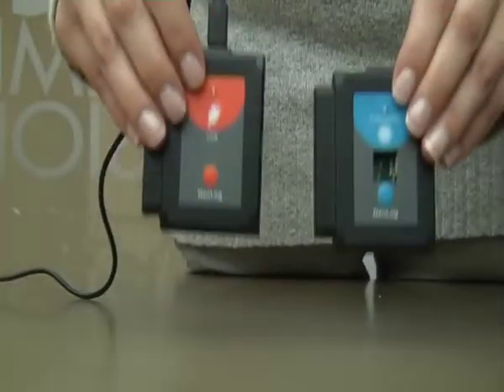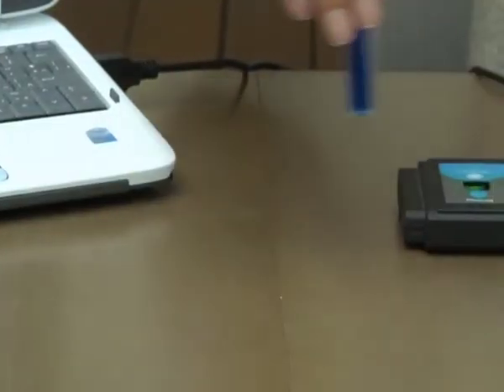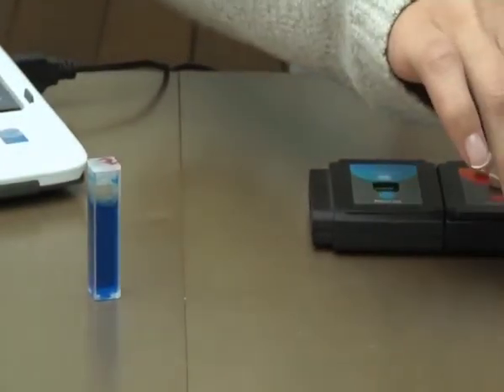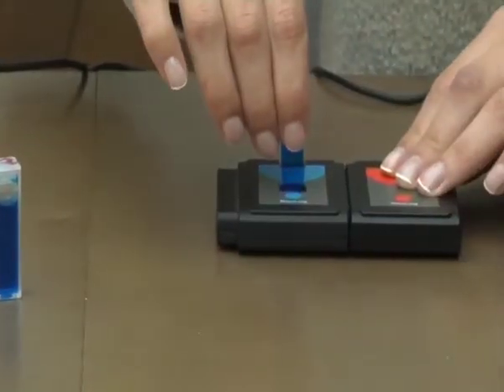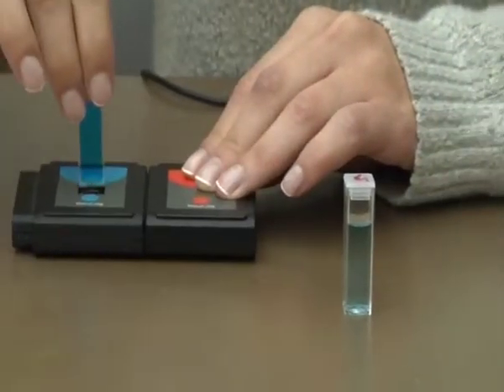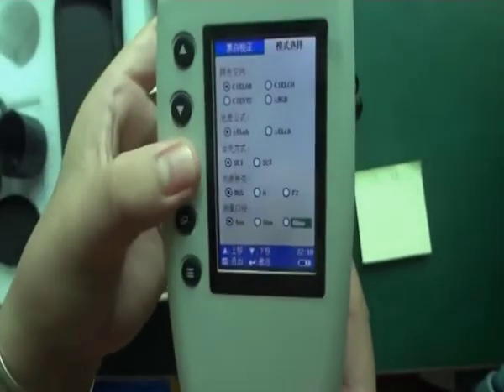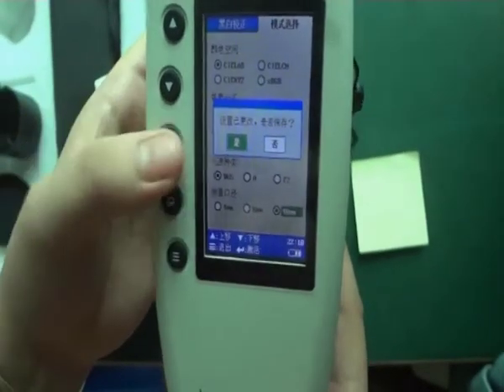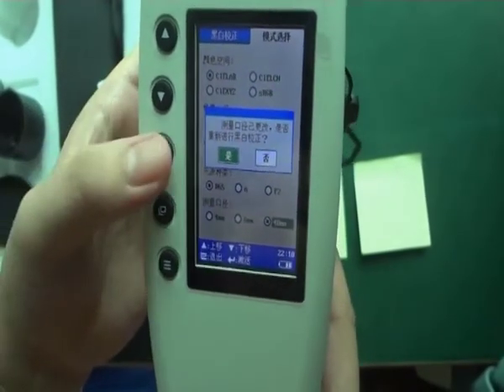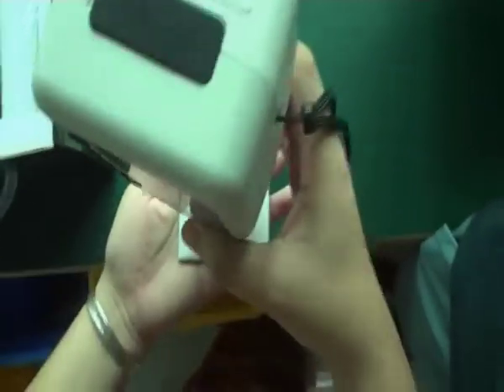The output from the colorimeter may be displayed by an analog or digital meter in terms of transmittance or absorbance. In addition, a colorimeter may contain a voltage regulator for protecting the instrument from fluctuations in mains voltage. Some colorimeters are portable and useful for on-site tests, while others are large benchtop instruments used for laboratory testing.